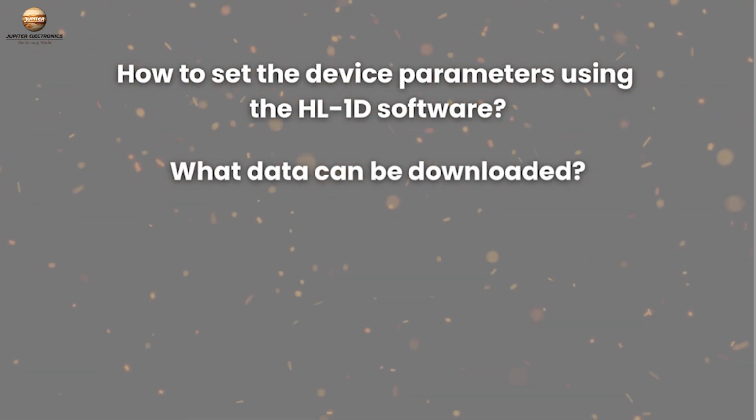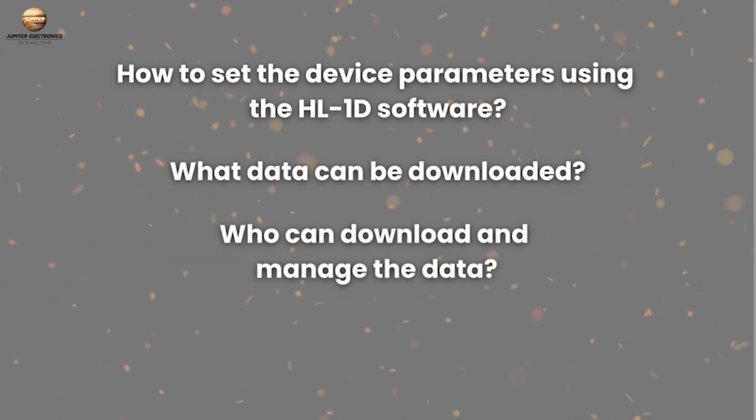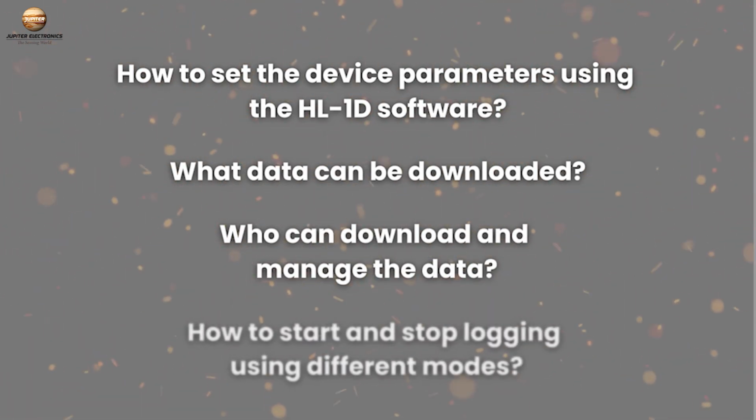What data can be downloaded, how to download and manage the data, and how to start and stop logging using different modes. Please note that the HL-1D comes with Rotronic's own software, but it is available at additional cost and has some user interface restrictions.